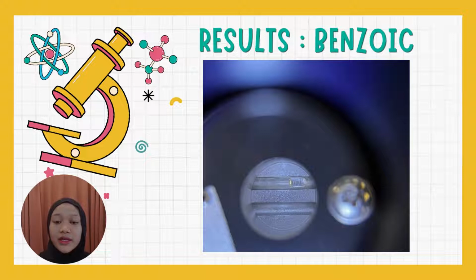degrees Celsius. Then for the salicylic acid, the range of its melting point to change from solid to liquid is 158 degrees Celsius to 160 degrees Celsius. Hence, we got the melting point of salicylic acid as 160 degrees Celsius.